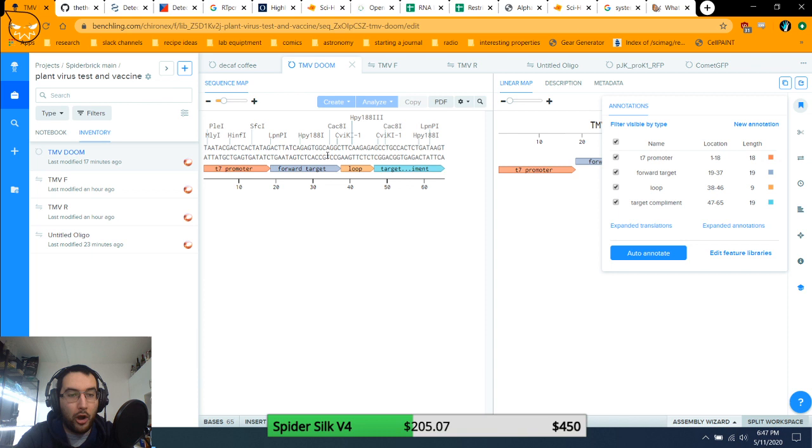I can then take that RNA extract, mix it with some RNases, which should cut all the RNA in there into individual letters, which could then serve as fuel for the rest of this reaction. The problem is now I need to get rid of the RNases, otherwise it'll destroy all of the stuff that I'm working so hard to make.